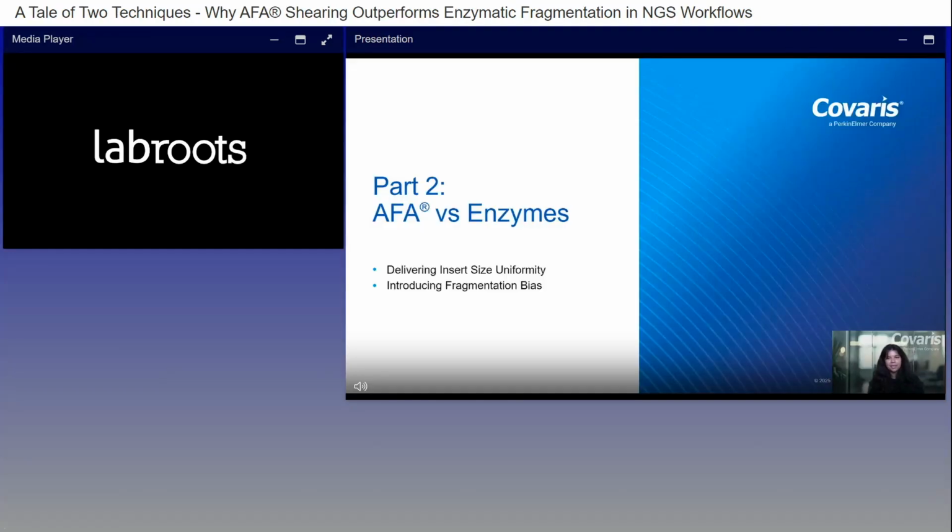So now that we know our players, we can begin to compare their performance. I'd like to talk to you about AFA versus enzymes in NGS workflows, taking a look at how well these methods deliver on the goals of uniformity and randomness that we've established.